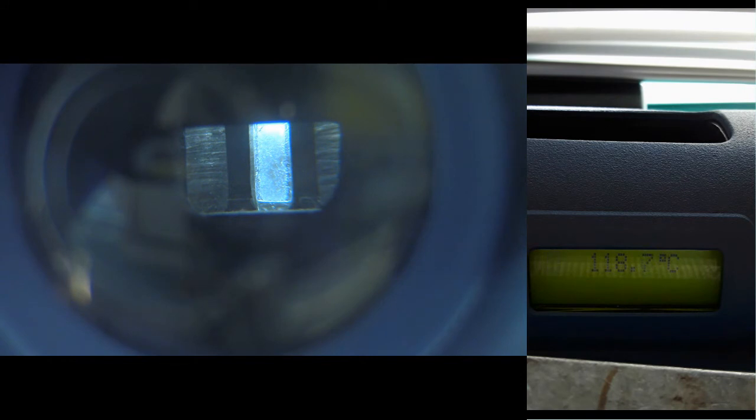So I'm taking the melting point temperature of benzoic acid right here. I'm going to record the temperature. Press stop. So right now the temperature is ramping up from 115 degrees Celsius to the point where the benzoic acid should melt. So it's currently 118.9 degrees Celsius, right? So I set it from 115, and it's slowly ramping up 1 degree Celsius per minute. So the literature melting point value is 122 degrees Celsius. So let's see if this is pure.